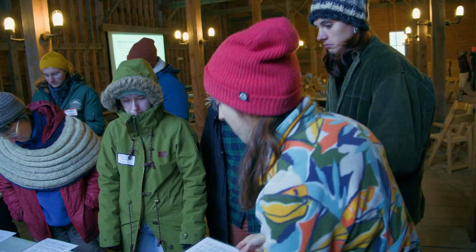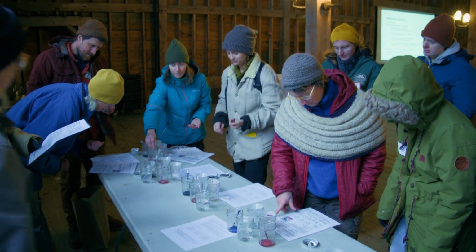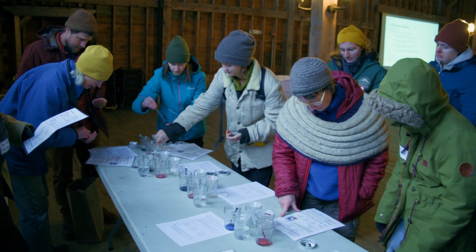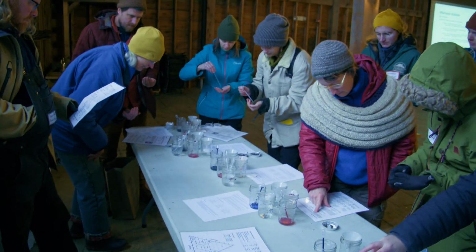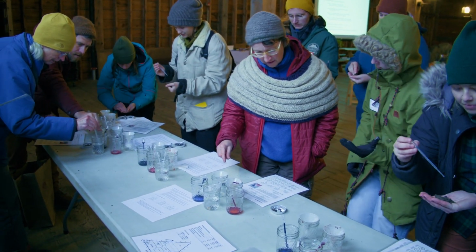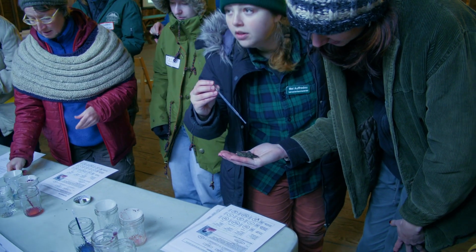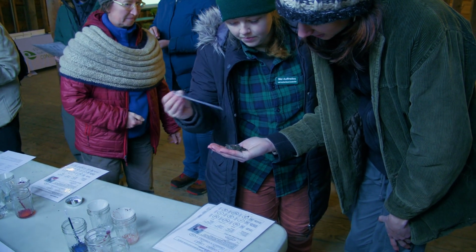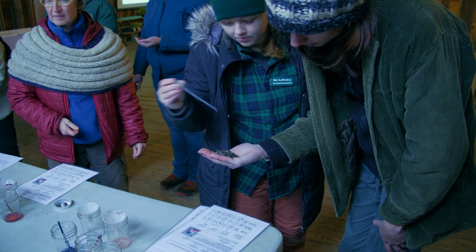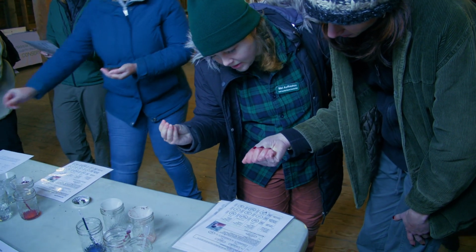Okay. Is this water? That is water, that you can use. So like moist putty. Are you okay if I add a drop? Yes. Okay. You need the soil into a smooth and plastic consistency. Does it feel like that? You need more water? Yeah. I need a little bit more water.